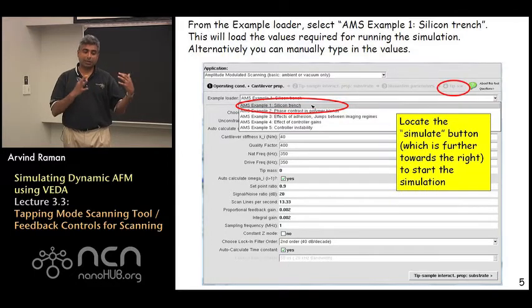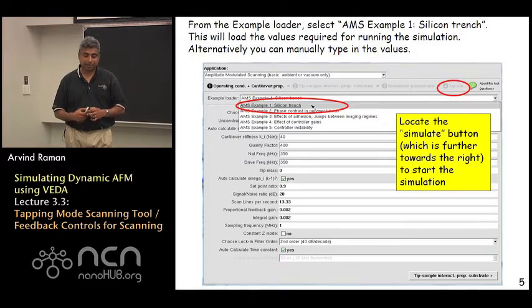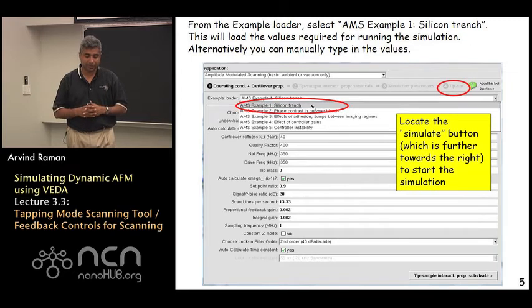So you can not only specify the substrate properties but feature properties can be done separately. In the feature properties you can choose a trench with negative height and choose all the properties and parameters in there.